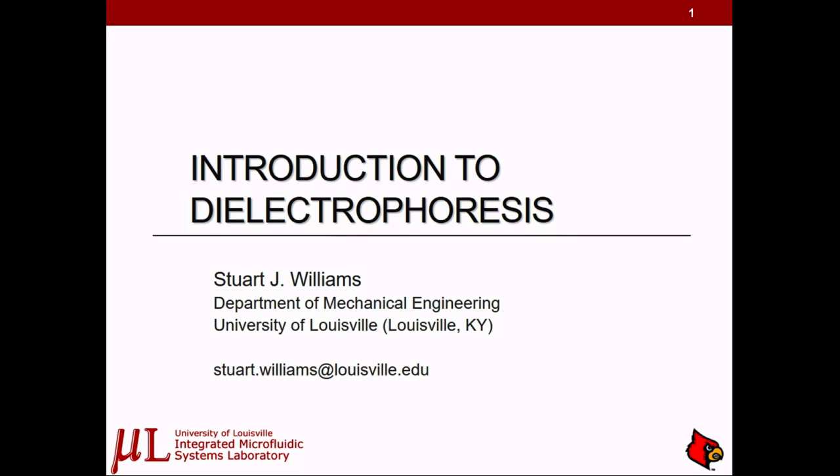Hello, today I'm going to create a video, and I'll break this up into a series of videos to introduce the topic of dielectrophoresis. So this is just an introduction in terms of the general theory. There are definitely layers of complexity to this, but I just want to give a general overview so you know the terminology, you know what's going on, you know at least how to begin to apply this technique, or at least learn about this technique.